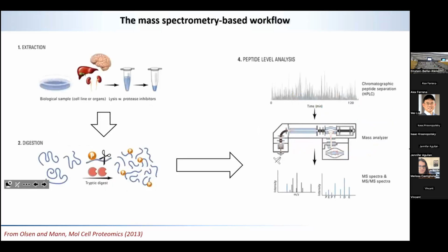First of all, I know you probably have seen this before, like many of you attended the biochemistry courses, because you guys are young students. I've been showing this for a while. A typical proteomic workflow, just for everybody to be on the same page, is usually based on mass spectrometry. So we extract proteins from nearly anything. We have projects in the lab where we analyze proteins from breath, from earwax, not the majority, luckily.